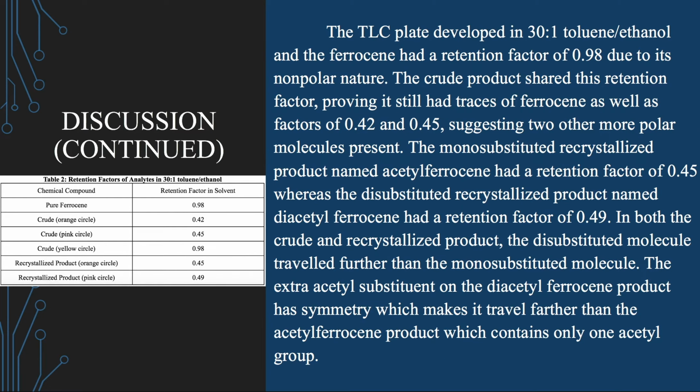So now we can talk about table 2, the retention factors of analytes in 30-to-1 toluene ethanol, which is what the TLC plate was developed in. The ferrocene had a retention factor of 0.98 because of its very nonpolar nature, and the crude product shared this retention factor, showing that it still had traces of ferrocene, as well as factors of 0.42 and 0.45, which suggest that 2 other more polar molecules were present.